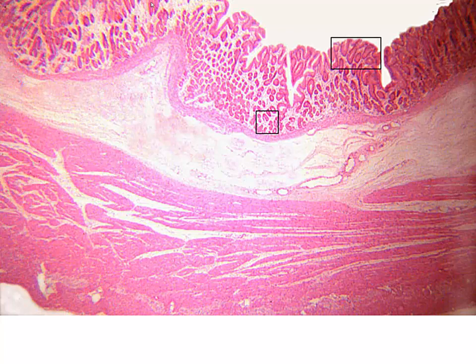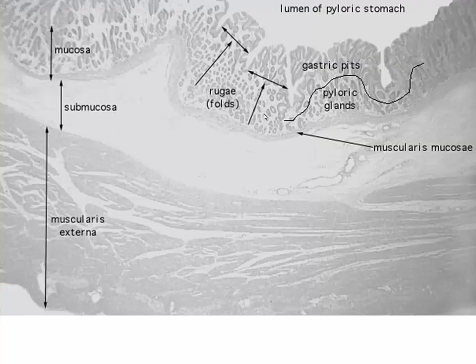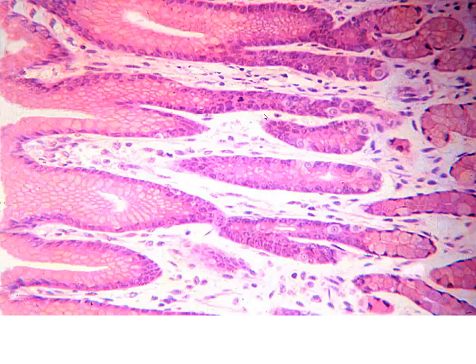Here we see a number of cross sections through our gastric glands down in the lamina propria portion. We can see our pits extending downward. Can't get a good look yet at the cells that comprise this, although we're going to look much more closely. Once again, on the side, we have our surface lining cells, neck cells. Here we're getting into our larger parietal type cells as we're moving down toward the base. This is all lamina propria, remember.